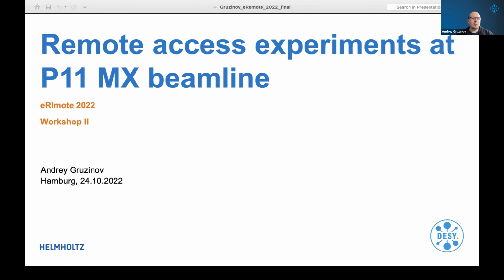So my name is Andrey. I'm working on a P11 macromolecular crystallography beamline, and I'm going to walk you through the practices that we are using for remote access of the facility.